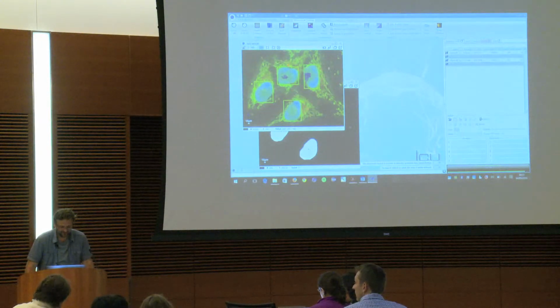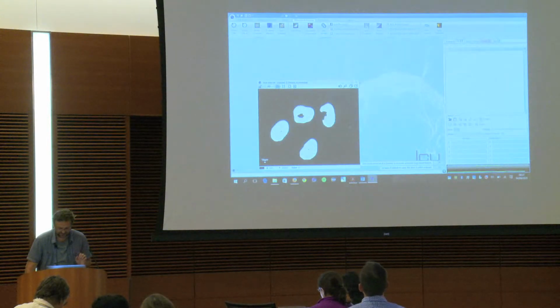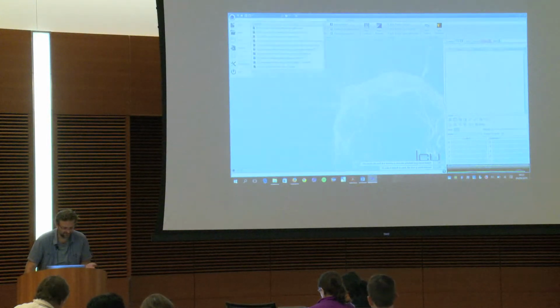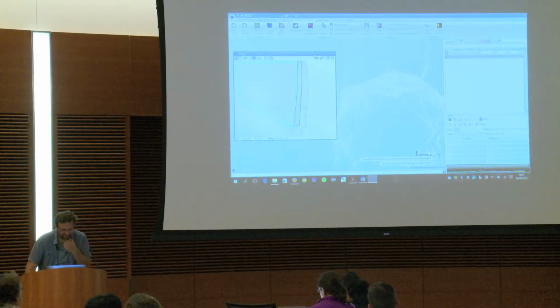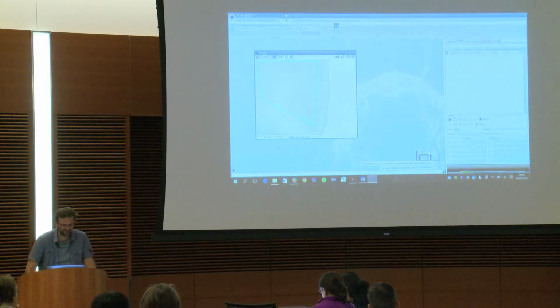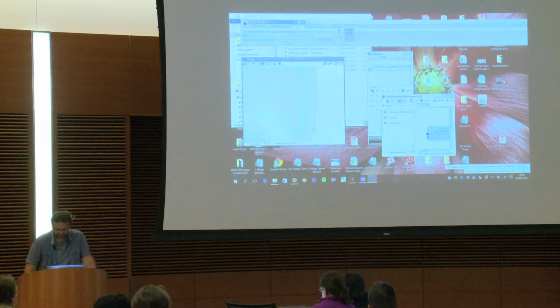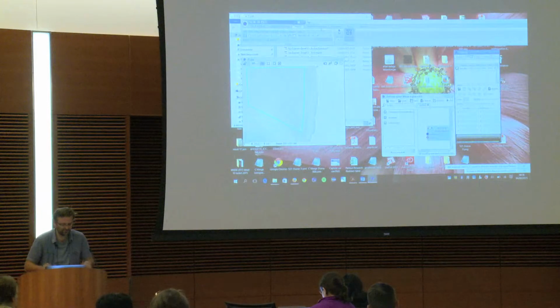But the idea is just to correct them, of course. The other thing I want to show is the communication with ImageJ, because it's the main focus here. So I take this one again, and let's say I have this row here, and I want to play with ImageJ. So I go to the ImageJ tab. This is the pure ImageJ one. We switch to detach mode here. So we have a lot of windows. You see, I asked Stephane to make it a full window because it's always a mess on my desktop.